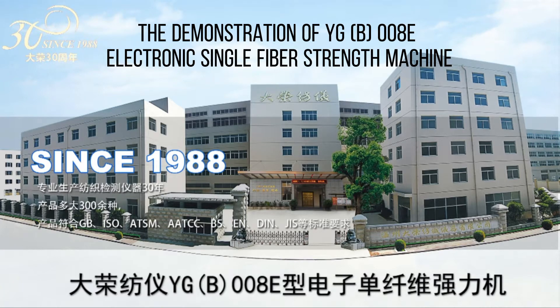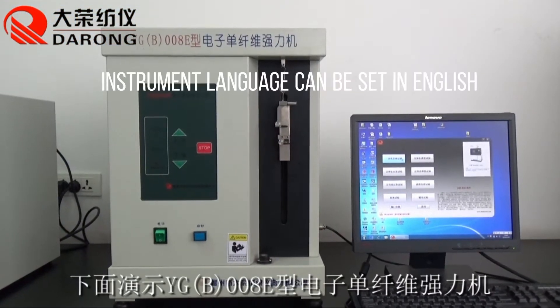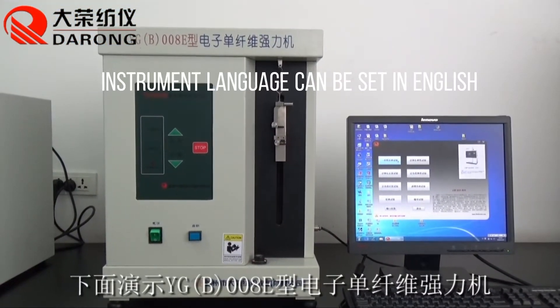This is a demonstration of the YG (B) 008E electronic single-fiber strength machine. The instrument language can be set in English.